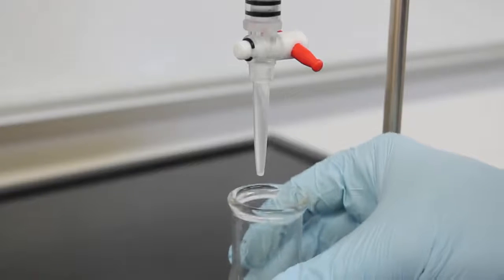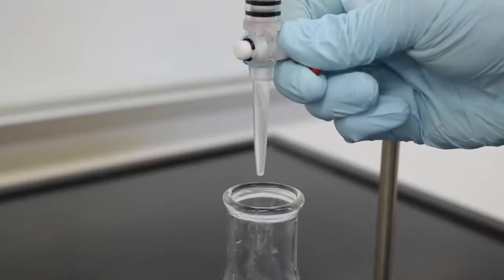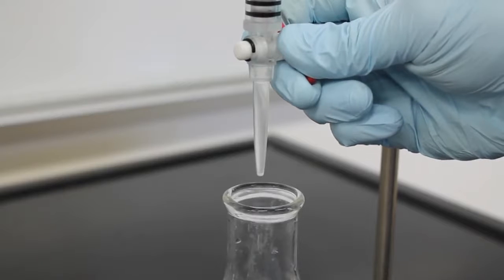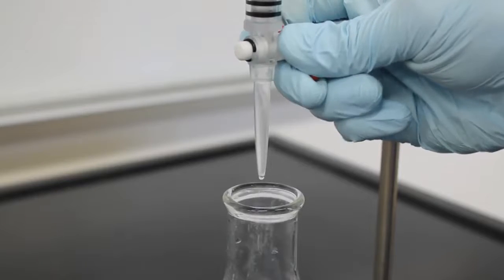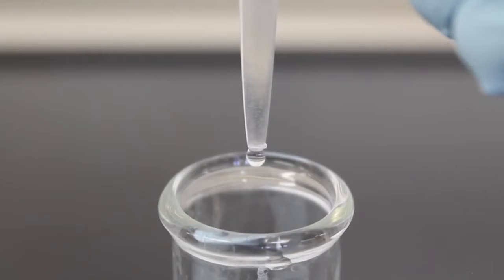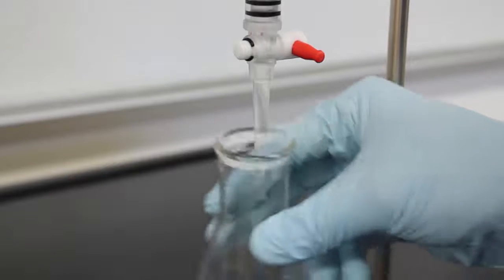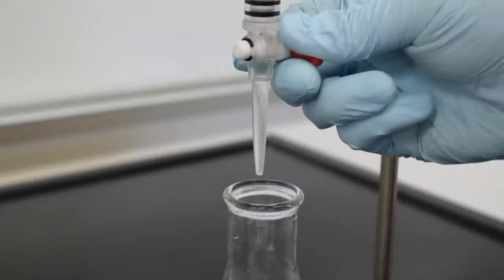Here is an additional tip for you when doing your titrations to help make your results even more precise. You can add half a drop of titrant using your burette by simply turning the stopcock slightly to let half a drop of titrant swell on the tip. By touching it to the side of your transfer container and swirling the solution, you will have added half a drop of titrant.